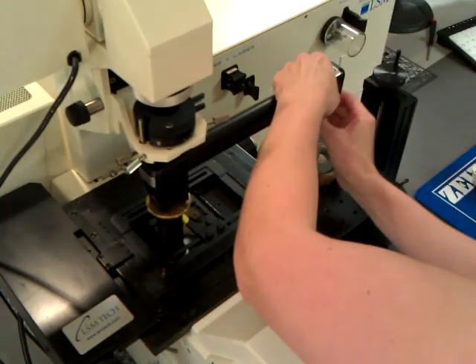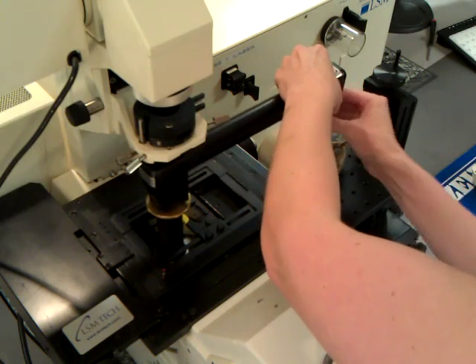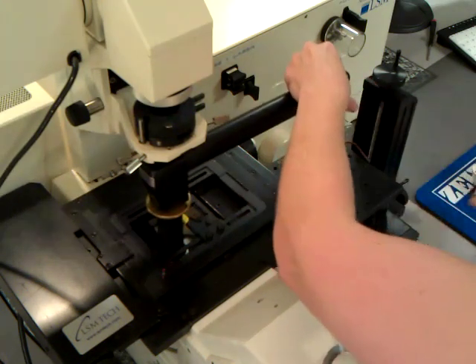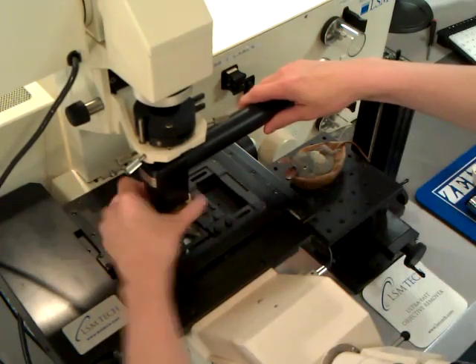To remove the objective inverter from the microscope, first remove the objective from the inverter. Then rotate the brass ring counterclockwise to remove the objective inverter from the objective hole.